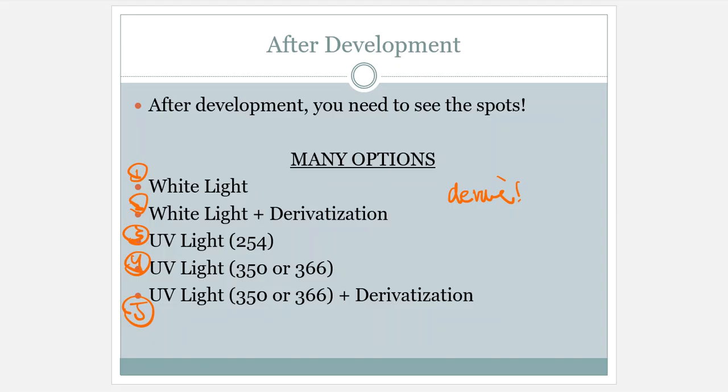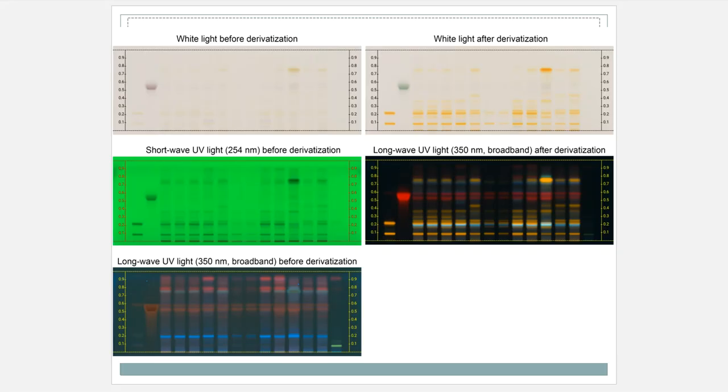So derivatization for us here is doing something, whatever that might be, so that we can see it. We need to talk about derivatization briefly, and I can go through the process of what derivatization is going to do. We are going to do derivatization in our lab experiments with our TLC and HPTLC instrumentation. So without going any further, I want to give you some options here.